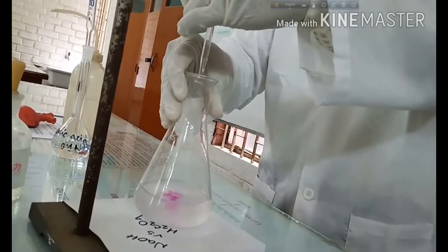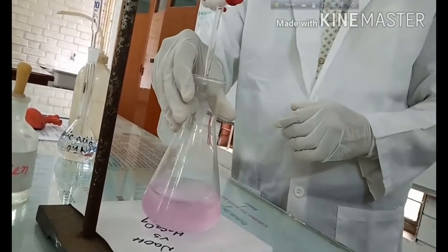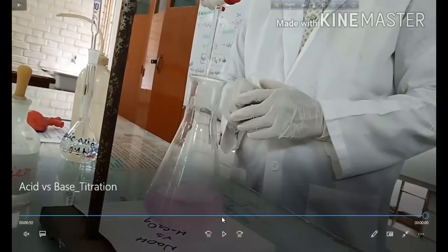So at the end of the titration, you have to be very careful, because if you add an excess amount of hydroxyl ion from the burette, then you will get the wrong volume of the sodium hydroxide. So that's the end point. From this experiment, you just take out the volume of the sodium hydroxide from the initial and final burette reading.